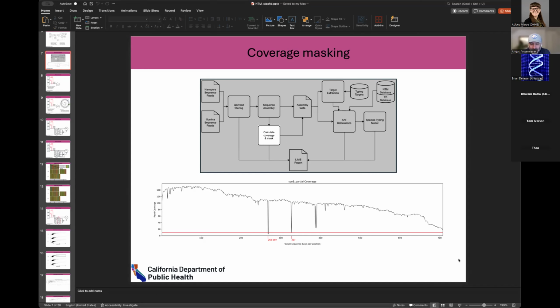The big caveat, of course, is that if there is a co-infection with highly, highly similar strains, and one of them has that SNP that you might be talking about and the other doesn't, then yeah, you could be getting a mixed assembly, and you could see something like this. That's something I have ruled out for a number of the abscessus strains that I've parsed through. But it definitely needs to be looked at.